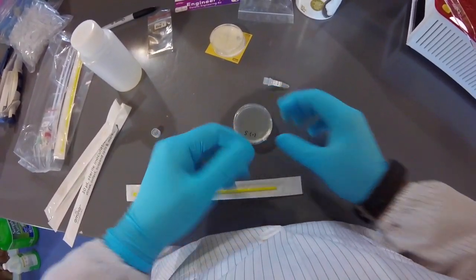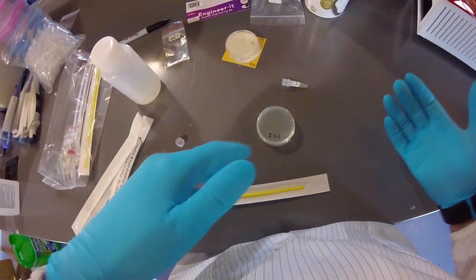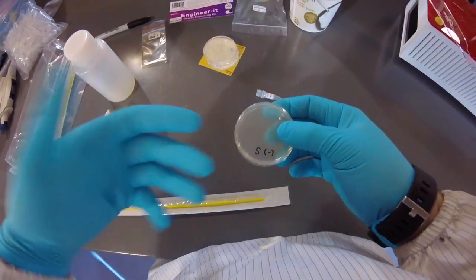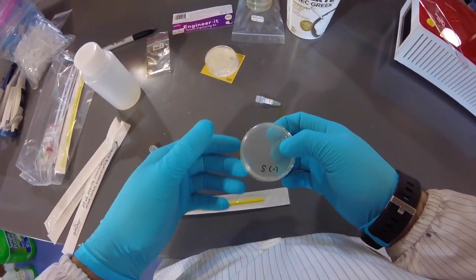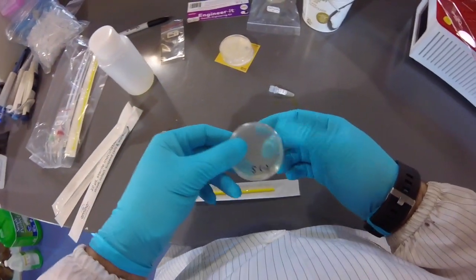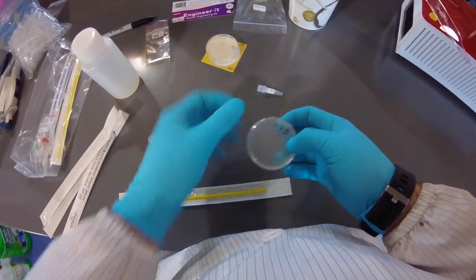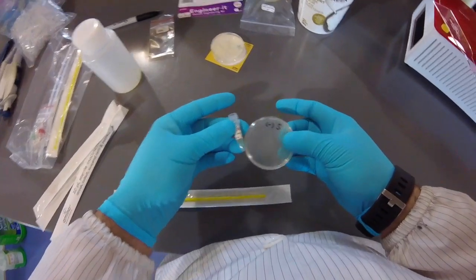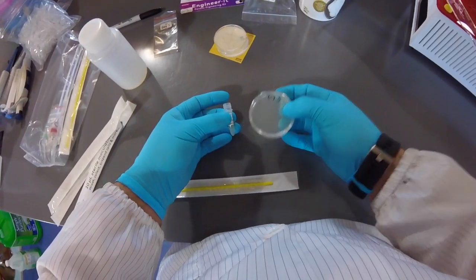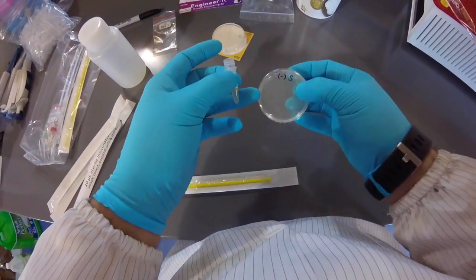And the idea here, so controls are often used to try and understand your experiment, make sure things are working properly in your experiment. And so in this case, we're going to do a negative control where we try and gauge whether the antibiotics were properly added to this Petri dish, okay? And we call it a negative control because we're going to be streaking some blank cells which aren't engineered, okay? And so they lack a plasmid, they lack the antibiotic resistance, and so they should be susceptible to the antibiotics in this agar.